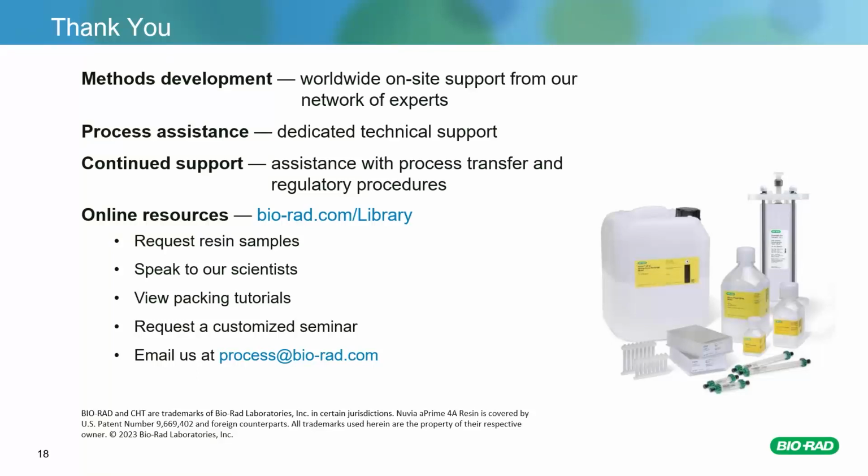So you will be able to learn from there which factors are important to control and how strong their effect is on the virus clearance. Also, you can find there the actual contour plot, which is, in my opinion, a good visualization, and it's nice to see what conditions are optimal with regards to virus clearance.